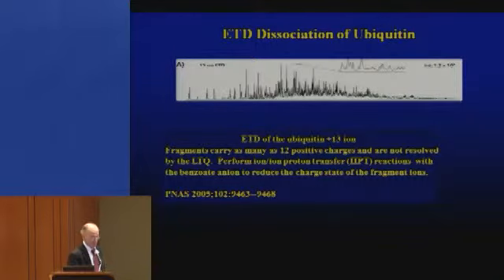I should point out, we're going to go on to look at proteins, but in the meantime, this was the second paper we published on this. And we showed that you could use this device and this chemistry and couple it with another one of Scott McLuckey's ion-ion reactions, which we'd like to use all of, but so far we've only used 2. Anyway, the point is, if you want to clean up a spectrum that is very complex and simplify it, spread it out so none of the ions overlap with charge in the same space, then it's possible to bring in a second reagent. In this case, it's the anion of benzoic acid. And now what you do is a proton transfer reaction.